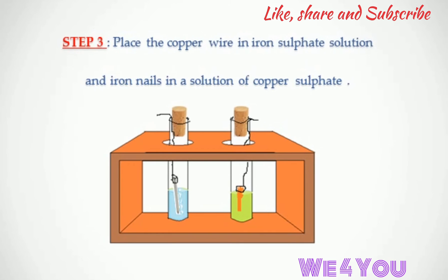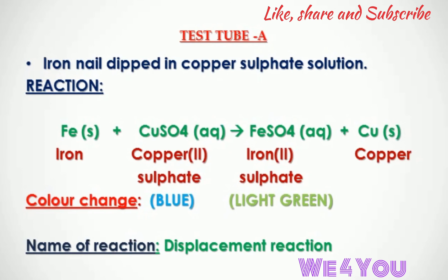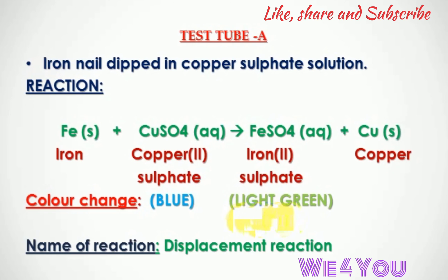Step 3: Place the copper wire in iron sulfate solution and the iron nail in copper sulfate solution. In test tube A, the iron nail is dipped in copper sulfate solution. Iron reacts with copper sulfate to give iron sulfate plus copper. The blue color of the copper sulfate solution changes to light green color iron sulfate solution.